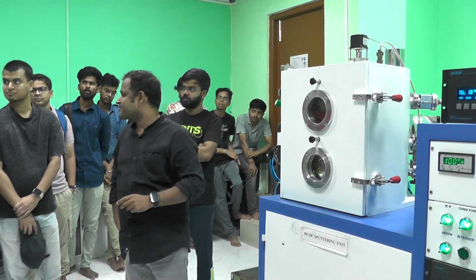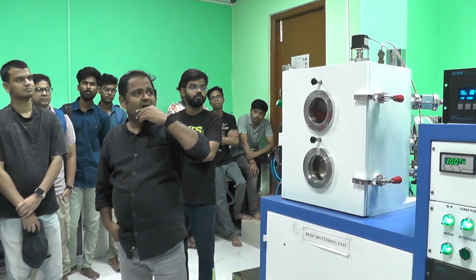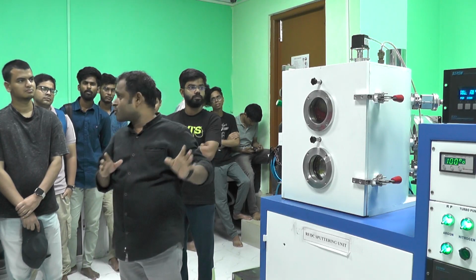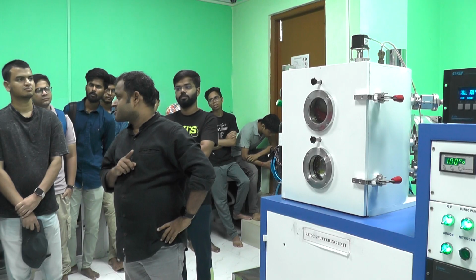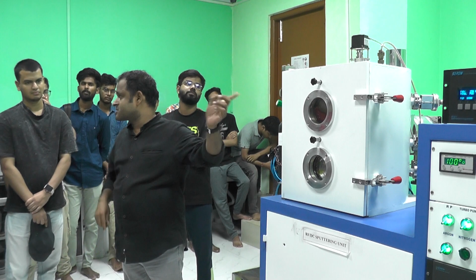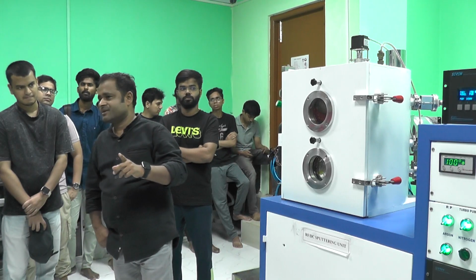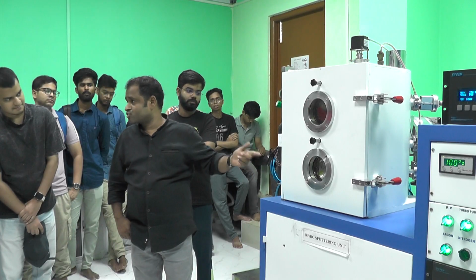Can you control the rotation rate here? Actually, this is the standard rotation, 20 RPM. So here we have 20 RPM. We cannot increase it. That is fixed.